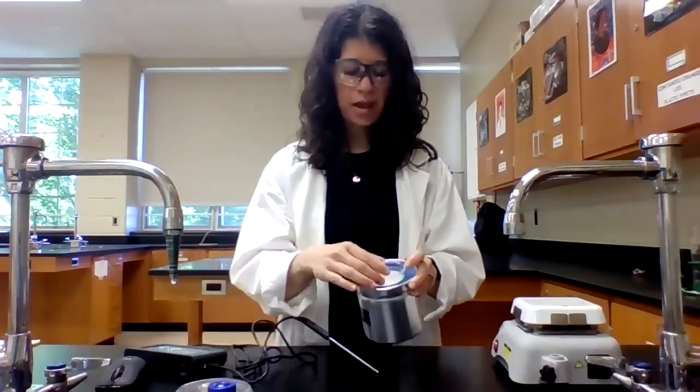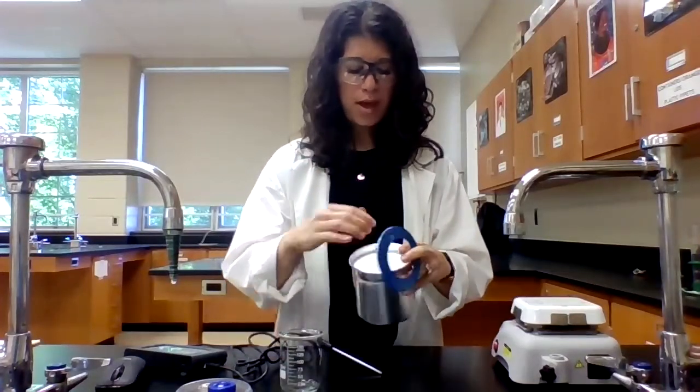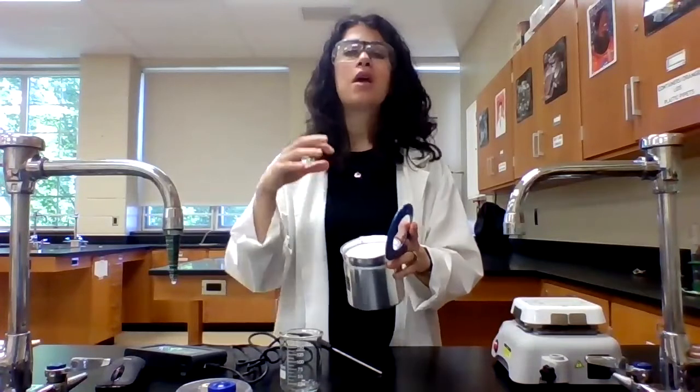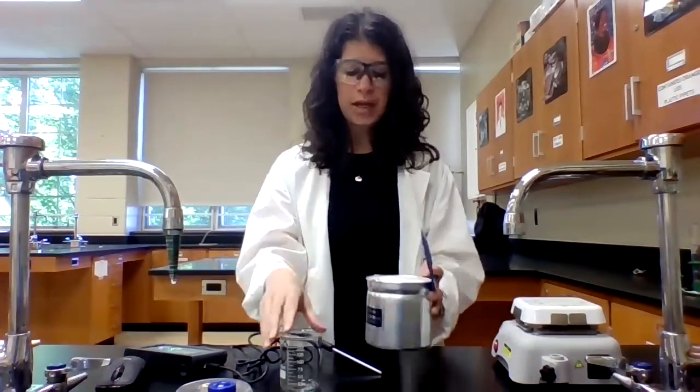And then inside the calorimeter is a 150 mL beaker, as well as styrofoam. Styrofoam is a great insulator, and so that's going to help ensure that any heat that's given off by the reaction stays inside.